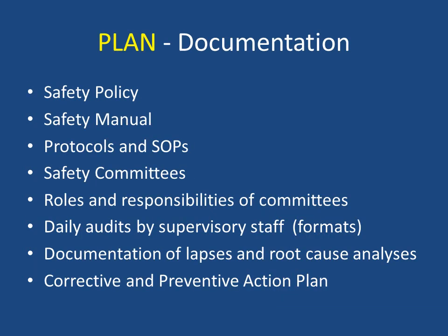Plan. This mainly deals with documentation. After risk assessment and evaluating the lab's premises, you need to put in place a safety policy. Make the policy a statement to include all issues that have been identified. Draft the safety manual.